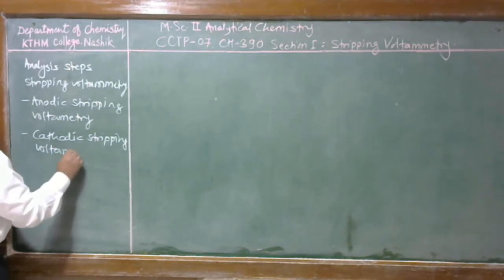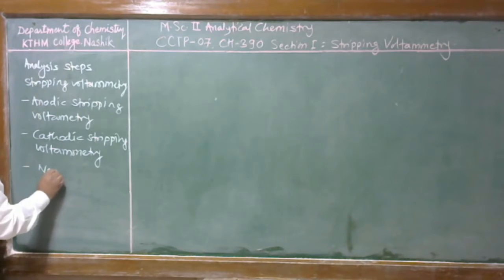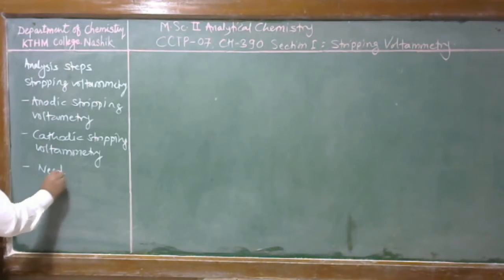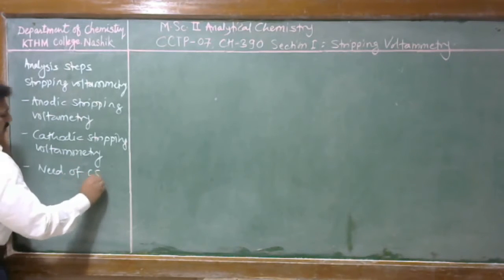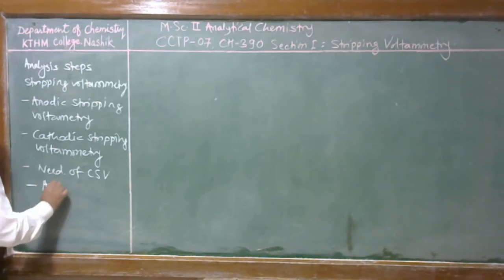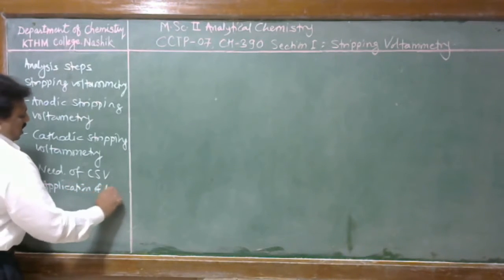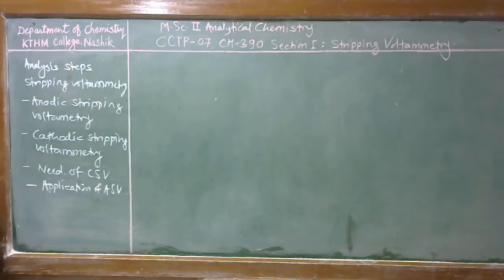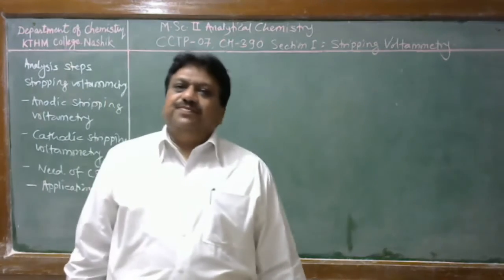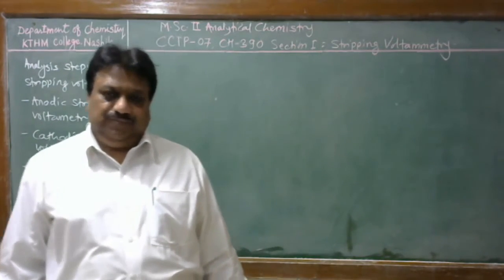We also discussed why there is a need for cathodic stripping voltammetry, and applications of anodic stripping voltammetry.